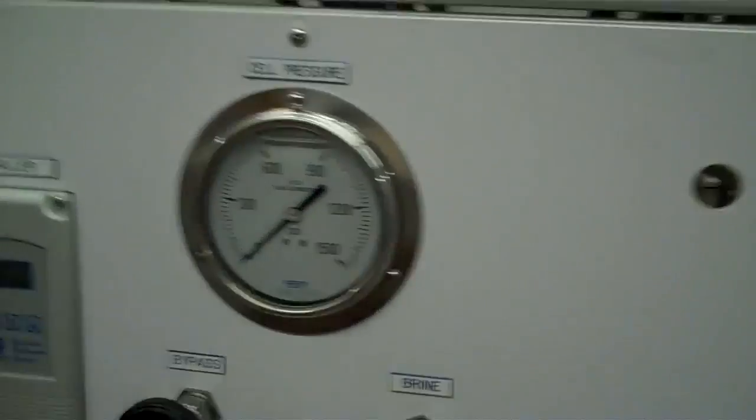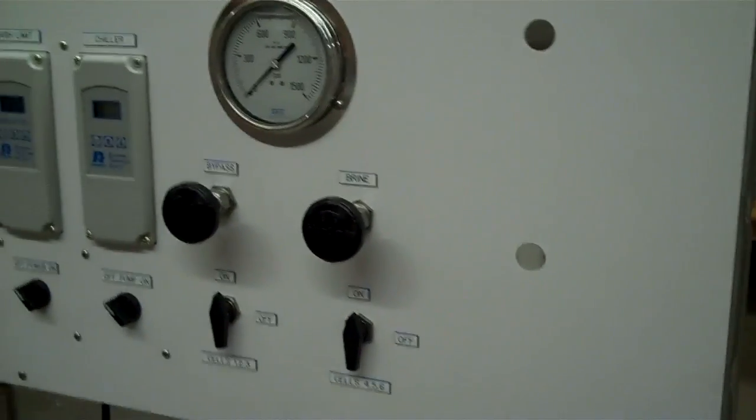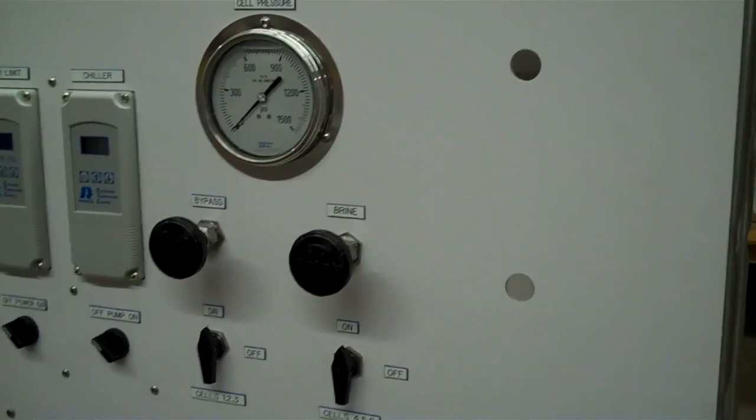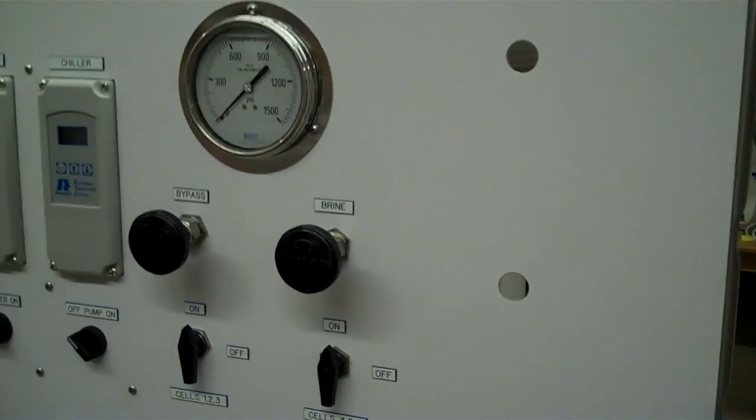The holes that you see there is where the flow meter goes. We're changing out the flow meter. We had a five gallon flow meter on it, now we're changing it to a three gallon flow meter.